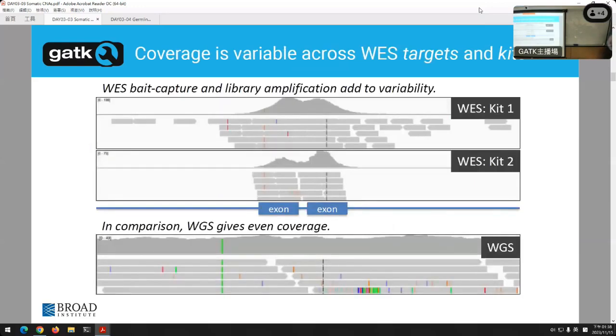All right, so here's an example of an exome on top, and there's different kits here, and a genome on the bottom. The genome is pretty easy. Let's start with that. It's not exactly the same coverage all across the genome. For the most part, a nice PCR-free genome has pretty consistent coverage. And it's usually consistent from sample to sample in terms of your average. So if you're at 20x in chromosome 1, you're usually around 20x in chromosome 2. And the same thing is true across participants, different patients.